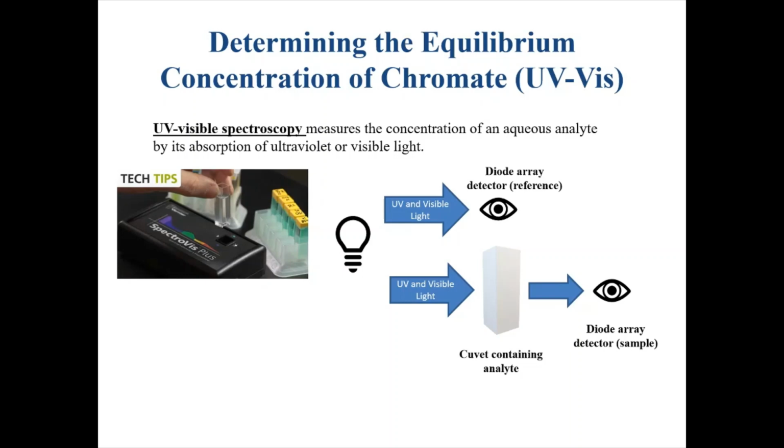So we can get the entire spectrum of visible and UV light in one go with a diode array detector. You can think of this as very similar to our eye, which when you look at something, you can see all the colors at once and their relative intensities. Except this eye is programmed not only to look at this qualitatively, but also quantitatively.